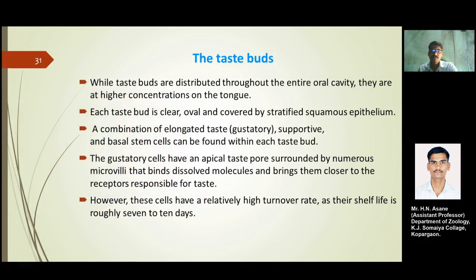As you can see, the taste buds are distributed throughout the entire oral cavity, with higher concentrations on the tongue. Each taste bud is covered by stratified squamous epithelium. We will see the structure of the taste bud in the next slide.